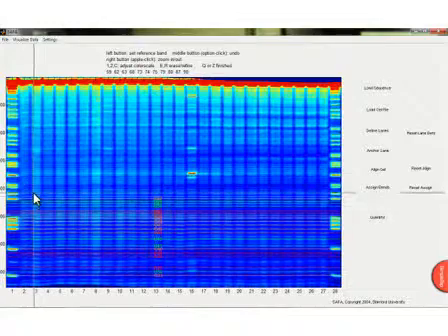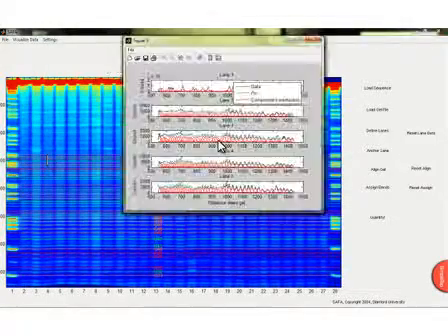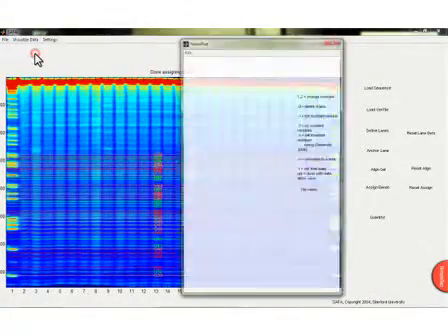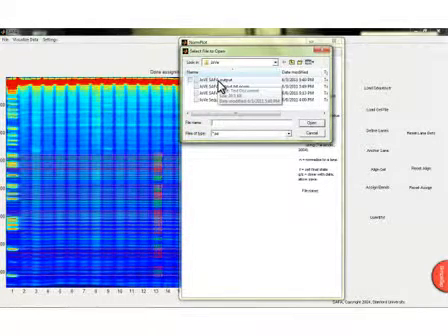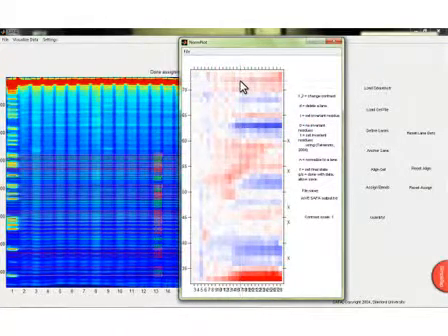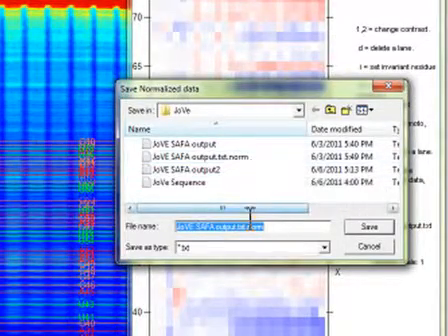Assignment of bands to nucleotides occurs in reference to the RNA's T1 digestion ladder. Quantify the band intensities and use the normalization/color plot feature to normalize and assign potentially invariant residues. Save the output as a .txt file.